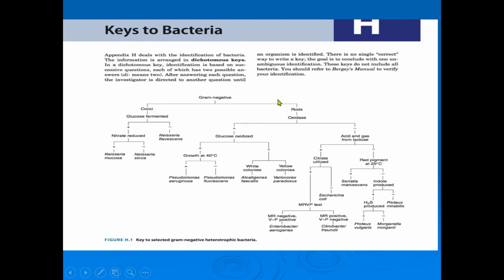So you can see here, a mistake in gram staining means the subsequent tests are all pointless because you've already made the mistake in gram staining. So every step is important. Gram staining is important. So even a simple gram staining is crucial in the dichotomous key approach. Okay.